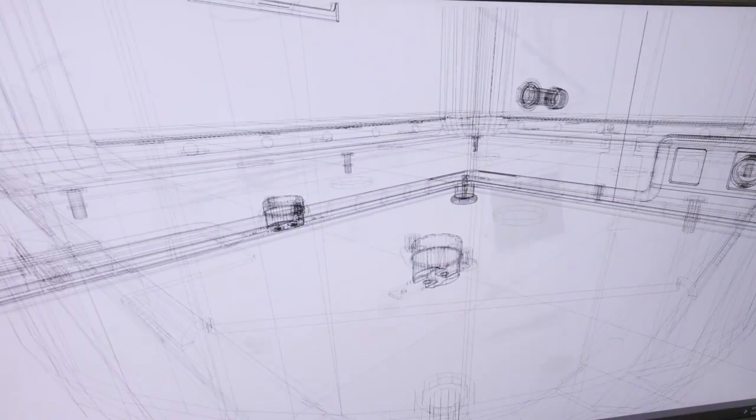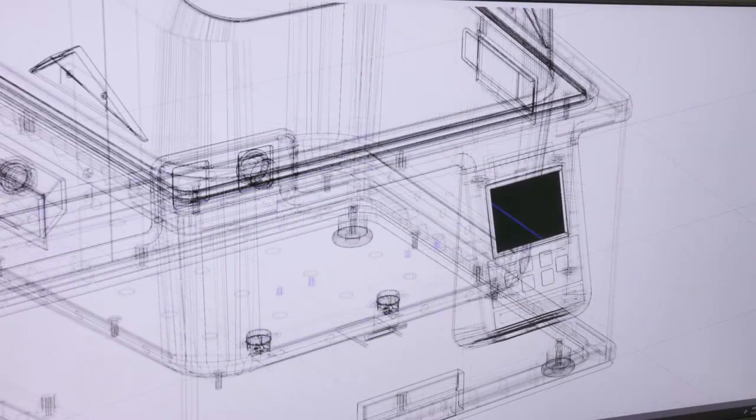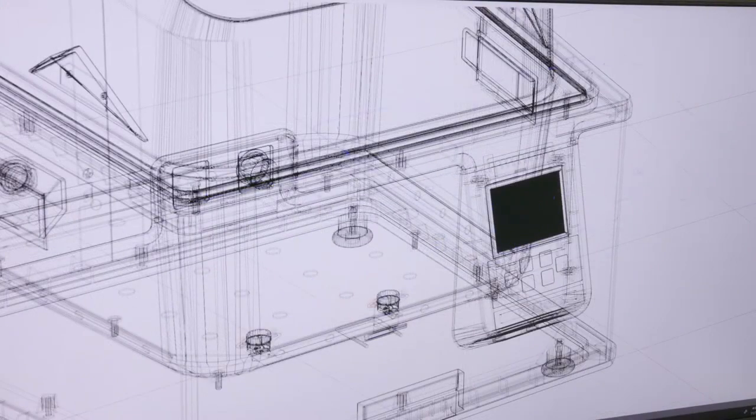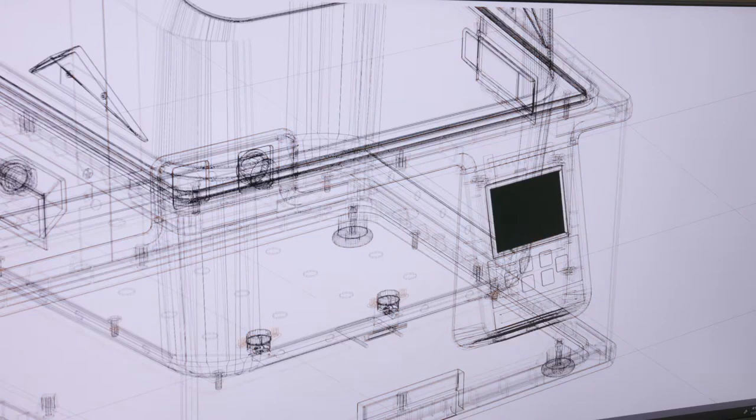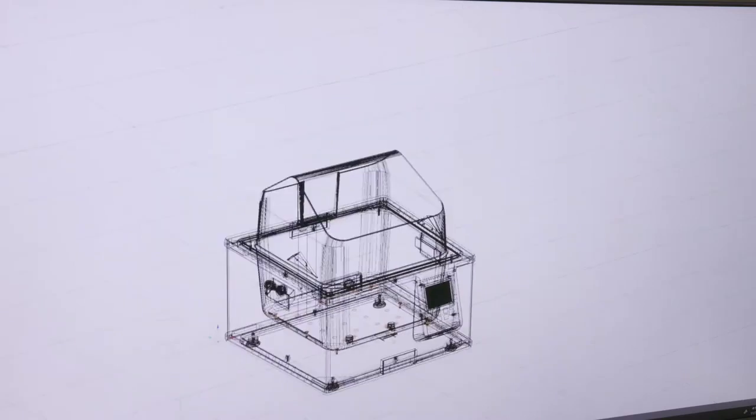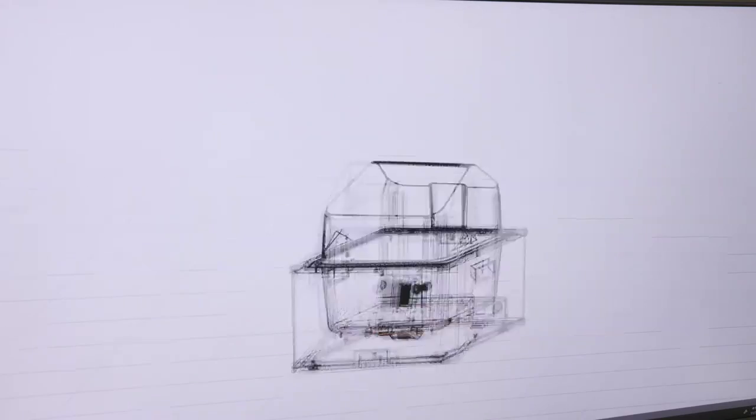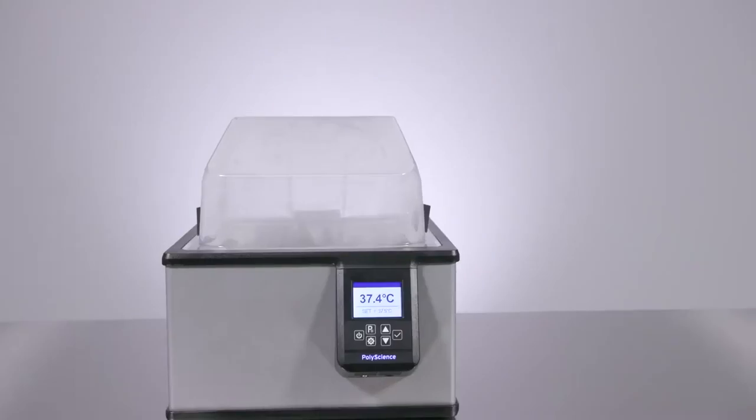Fifty years of research and innovation have come together to offer you the best water bath with the greatest ease of use on the market.